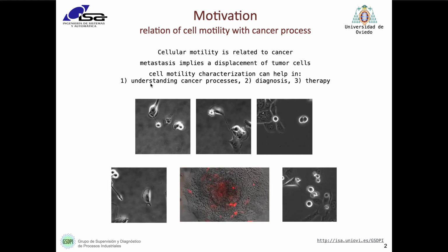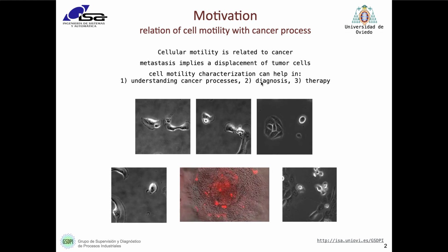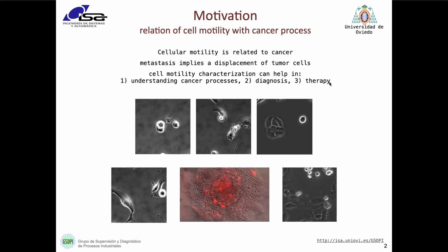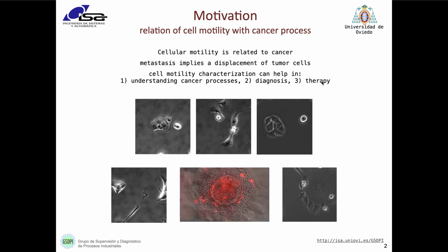1. In understanding cancer processes. 2. In cancer diagnosis, since certain movement characteristics can be used as biomarkers. 3. In exploring therapeutical methods by understanding the conditions that affect the cell motility.